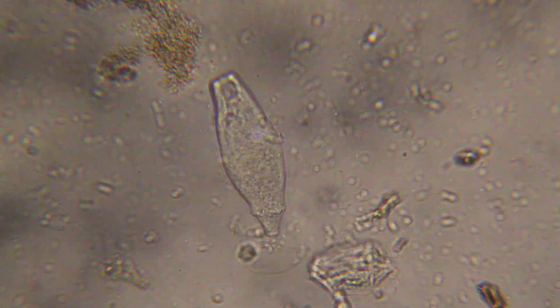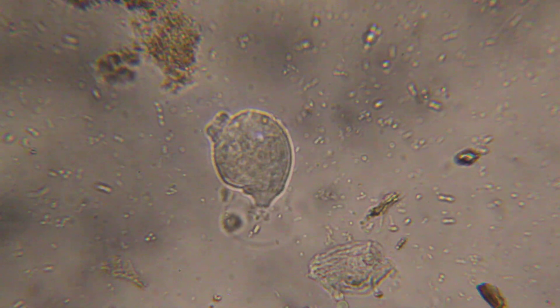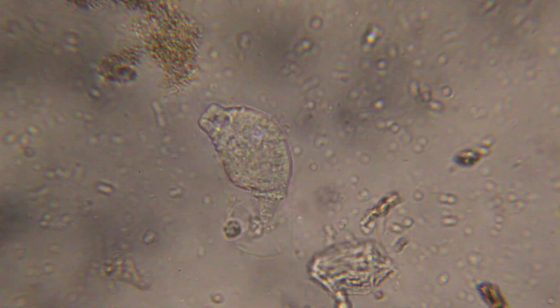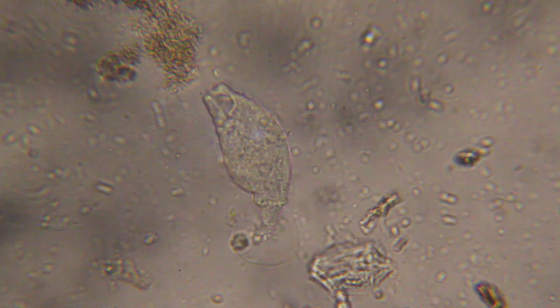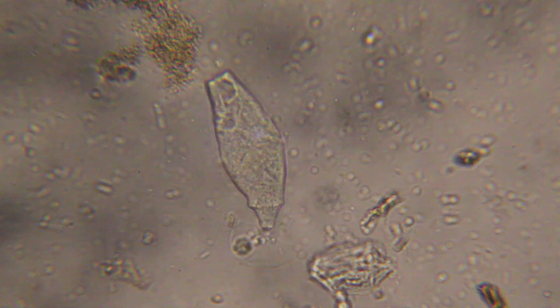A lot of things are doing well anyway. This guy here is coming alive, and a lot of bacteria are quite well. They must be made out of antifreeze.